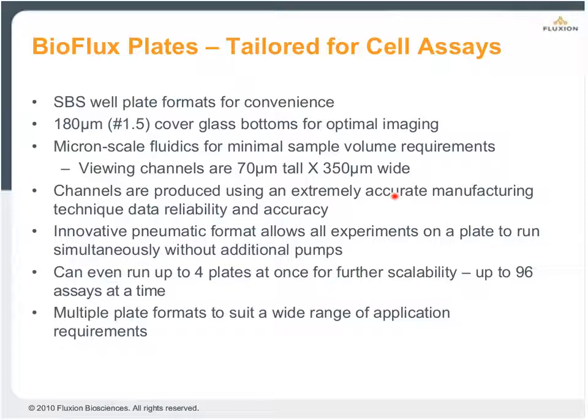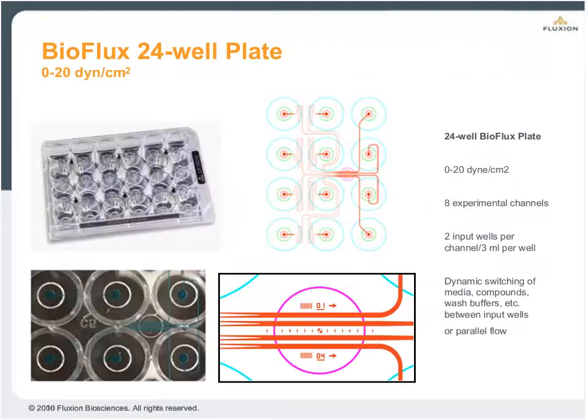Okay, let's just talk quickly about the different devices, and then we'll get on to applications. The plates come in 2 main formats, 24 and 48 well chassis, and each one has a really different purpose. The focus of the webinar today is on the functionality of the 24-well device, which has 8 channels. You can see half of the plate shown here.